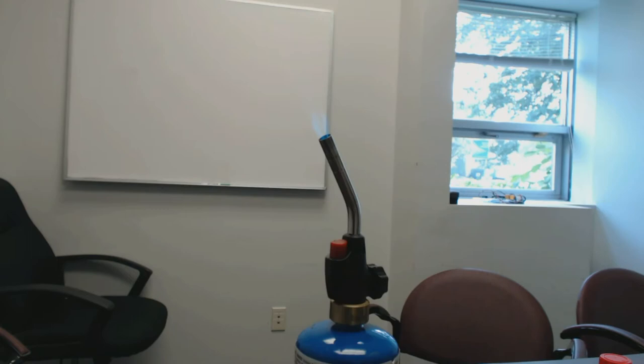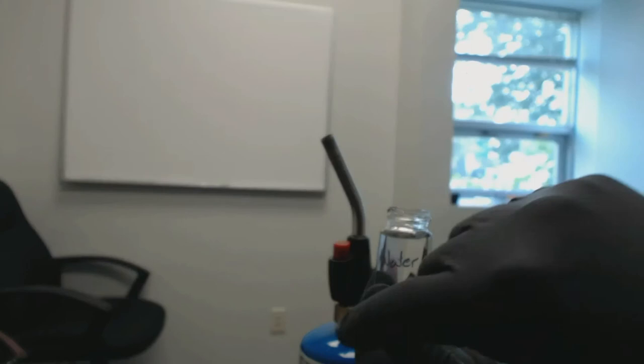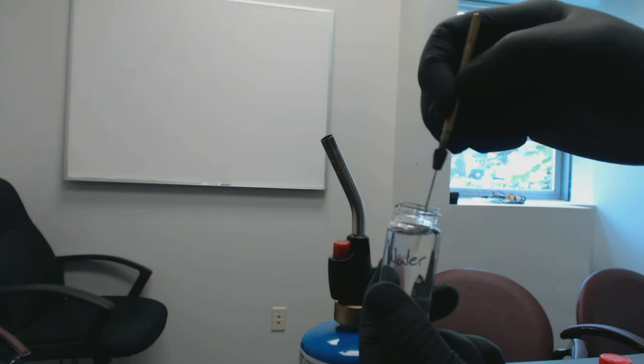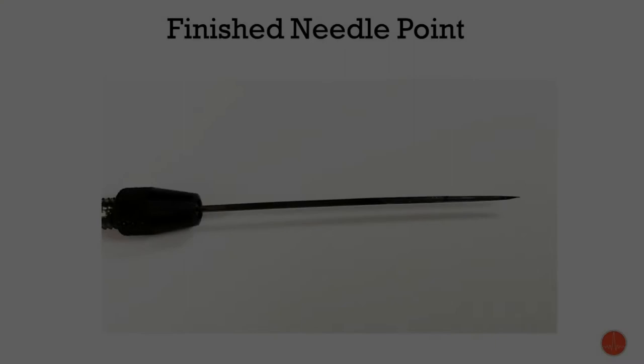Just remember to shut off your flame. Then we are going to get out the vial of water and wash the needle off. So here is our finished needle point.